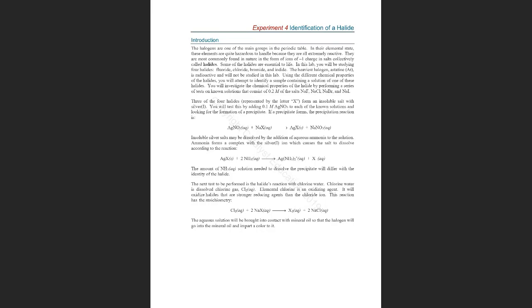Astatine is the heaviest halogen. It's the last element in group 7. And it is very unstable and radioactive. So we will not study astatine in this lab. We will only do qualitative analysis for these 4 halides.